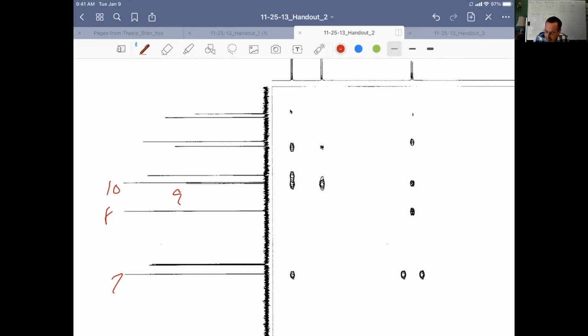At 256, it might be a little tough, but if you go to NI equals 512, you can resolve down to a couple of tenths of a ppm. We've gone even as high on some of our problems, the final exam problems, we've gone even as high as 1024 when we've wanted to help people out with really close carbons.